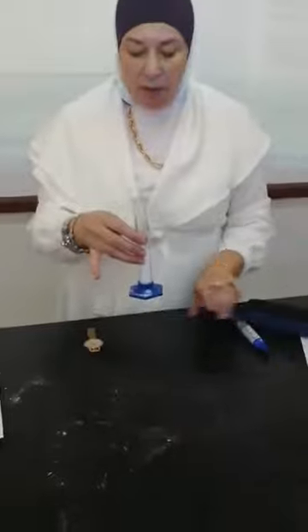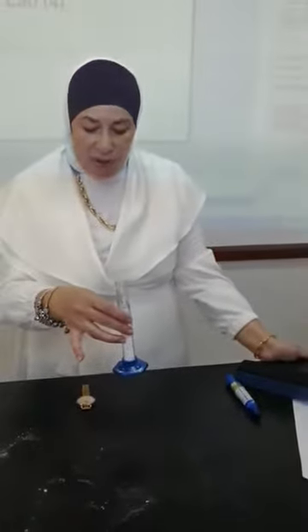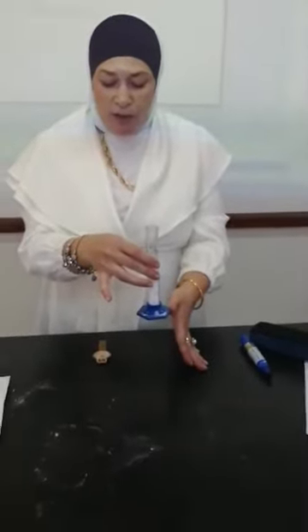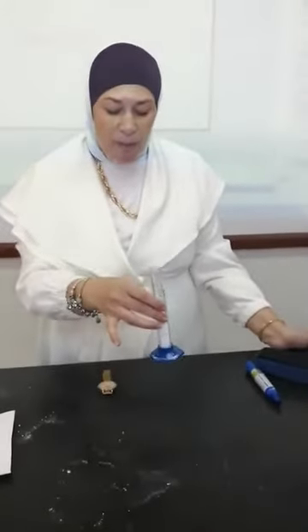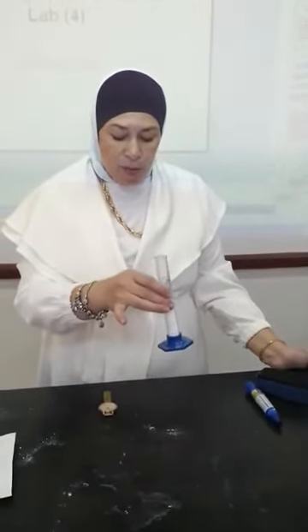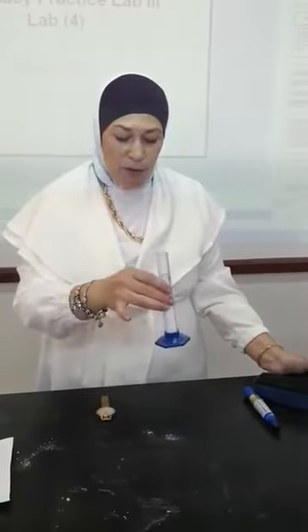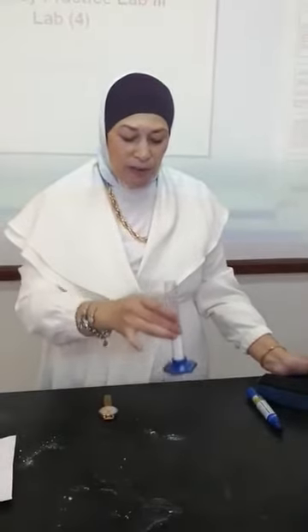I need to use a watch to adjust the tapping procedure. From 1 inch height, I will make a tap every 2 seconds for 2 minutes.